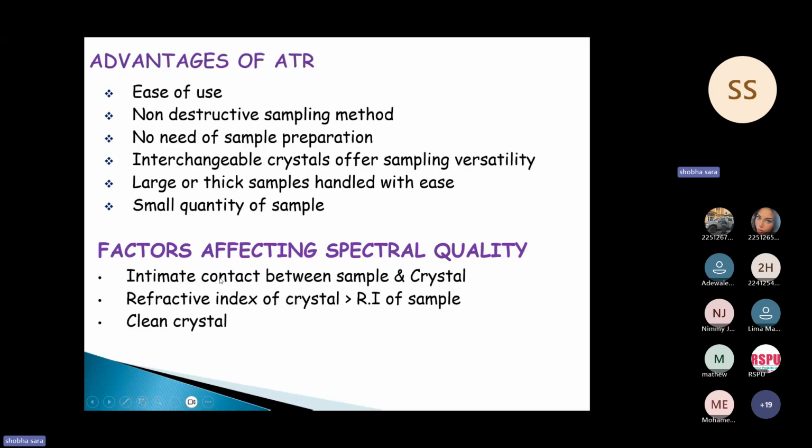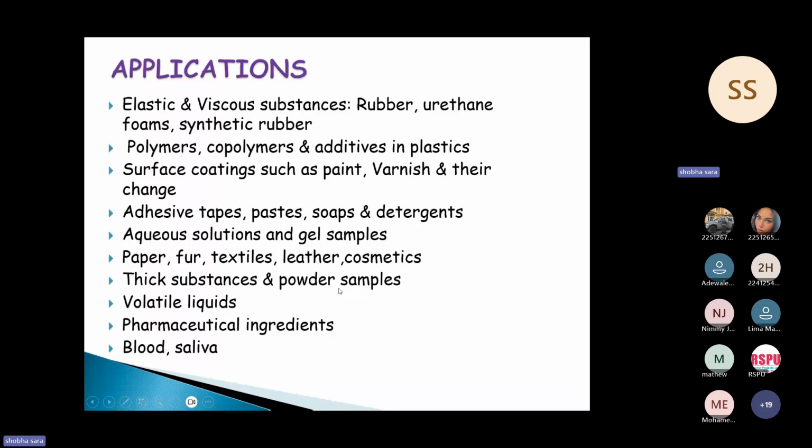And as I told you, the intimate contact is very important. Refractive index should be greater and the crystal should be really clean. Now, what are the applications? I told you these are the applications.